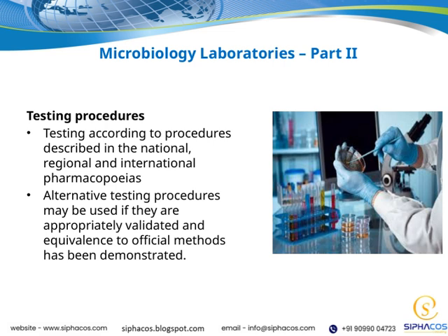Now, shifting focus to microbiology laboratories, which are a critical part of our testing framework, especially in Part II. It's important to understand that microbiology testing plays a vital role in ensuring the safety and integrity of pharmaceutical products. Overall, adhering to these validated procedures, whether official or alternative, helps maintain high-quality standards across the board.